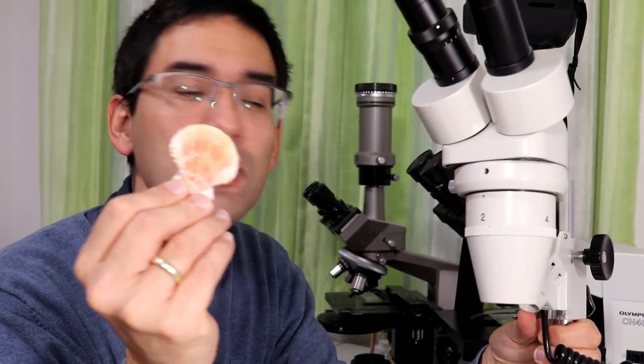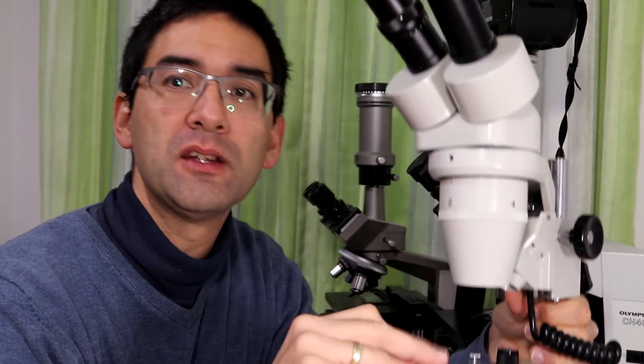Stereo microscopes allow you to look at objects that are opaque, that means that are not transparent. So if for example you would like to look at this seashell, it's quite easy. You can simply place it on the stage of the stereo microscope and you can start observing.